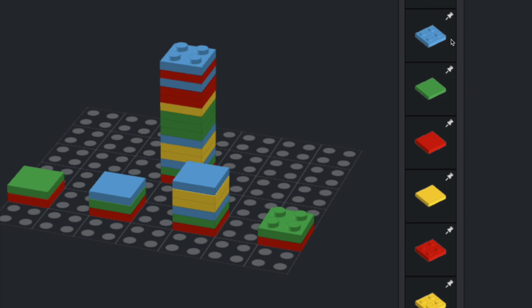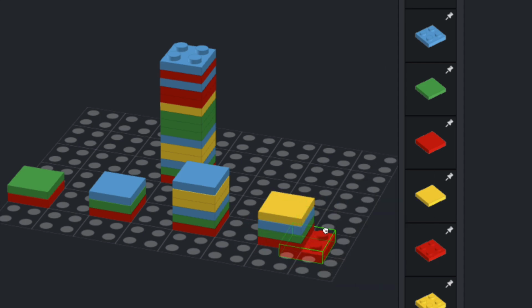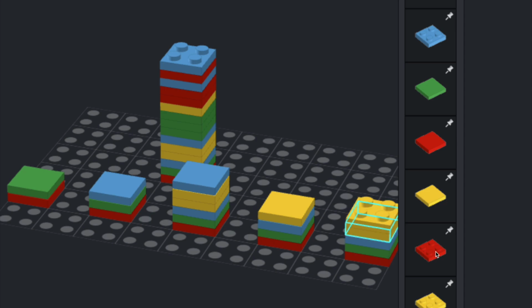Now, remembering that in Sanger sequencing, those ddNTPs are also tagged with a fluorescent dye. So what that means is that end block is fluorescently tagged with a dye that reflects the nucleotide that it is. So in this example using the Lego, we could say that the blue blocks are a blue dye, that would be say a FAM dye, that's representing an A molecule. And the yellow ones might be a T, and the red might be a G, and the green might be a C, for instance.